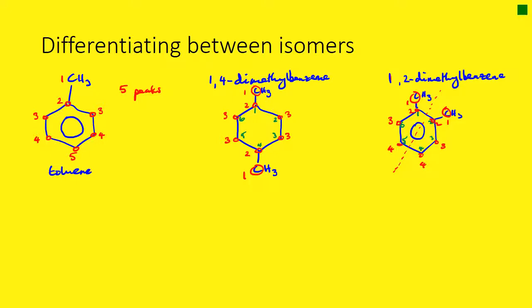So that just about completes what we need to say about carbon-13 NMR. Last thing, let's just mention solvents, so the solvent for the molecule. And in both proton and carbon-13 NMR, often the solvent, so recognize that we're not talking about TMS, which is the standard. We're now talking about the solvent. Solvent is often this compound here, CDCl3, right, where D is an isotope of hydrogen called deuterium.